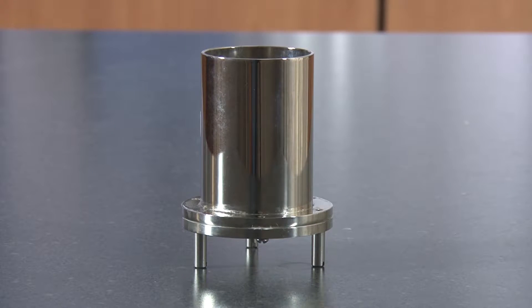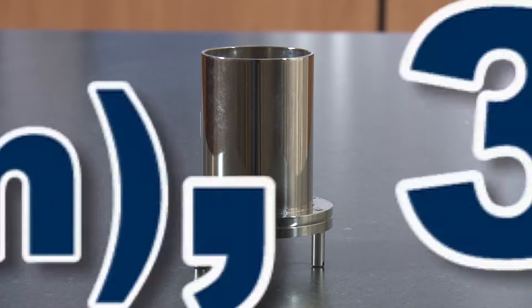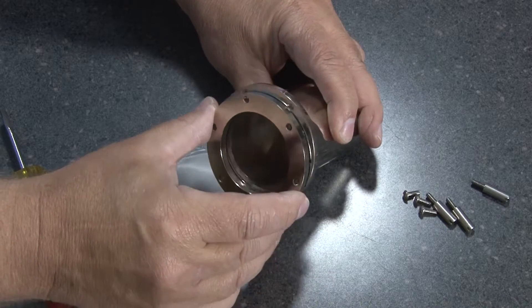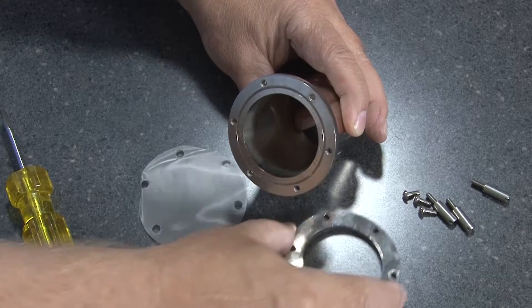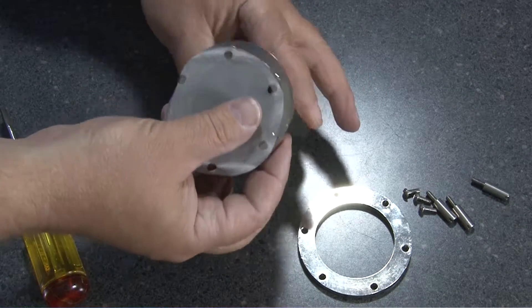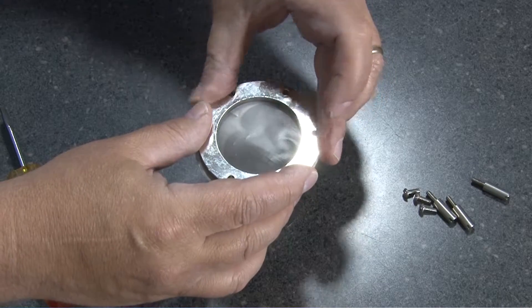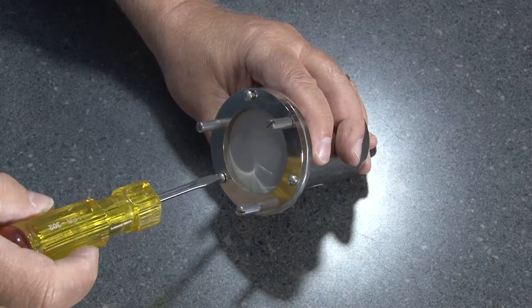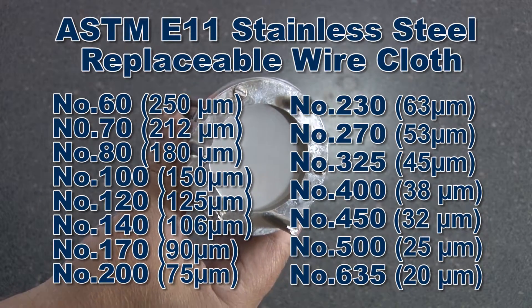Nickel plated wet wash replaceable mesh sieves are available in 2, 3, or 4 inch diameter frames. These two-piece solder-free nickel plated wet wash test sieves have replaceable ASTM E11 stainless steel mesh disks with opening sizes from number 60 to number 635.